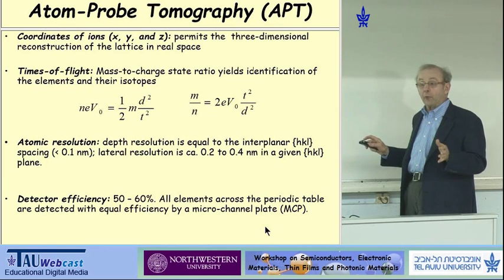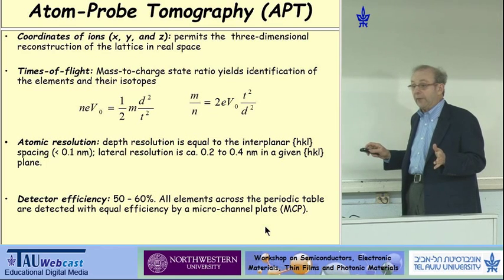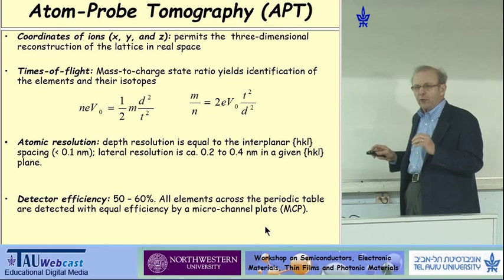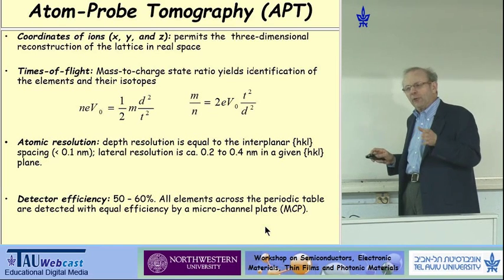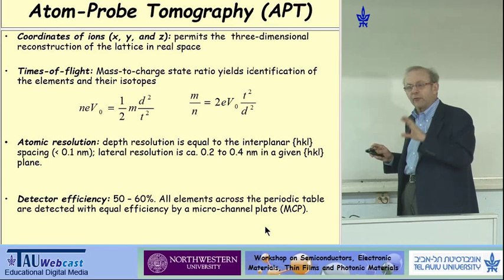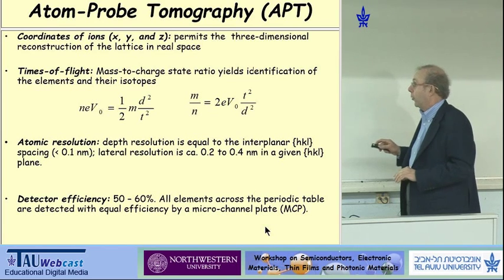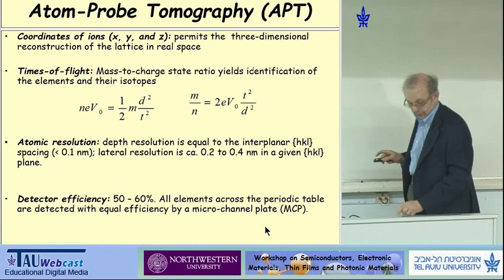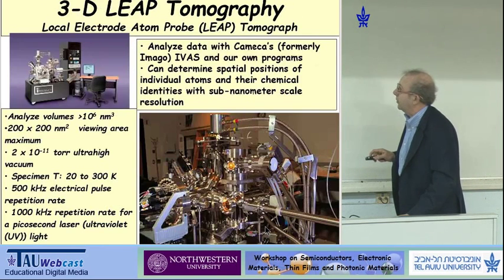Channel plates have been around for a long time. They're well over 50 years old, and they were developed in the United States. I think it was in an Army research lab for night vision to replace sniper scopes that were used in World War II. So when you see soldiers in the dark shooting, the image is usually in green, and that green is from the phosphor that they use. So these channel plates, this is what makes the technique possible. One of the things that makes the technique possible.